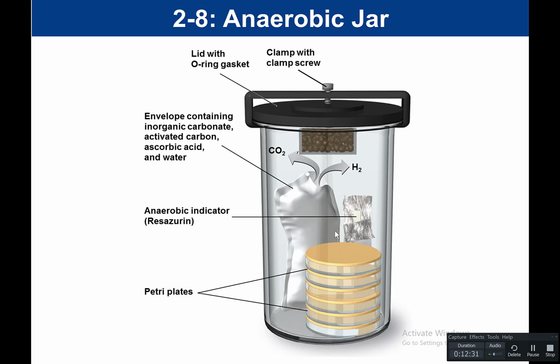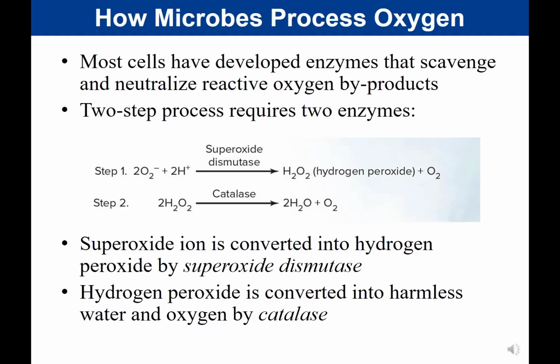And so I'm going to walk you through and talk about what those enzymes are there for, what processes they neutralize, and then also what, as a result, would be an organism's oxygen requirements. And so we're going to go through some background information about O2 requirements for cells, and then we're going to talk about what our results were in our anaerobic jar.